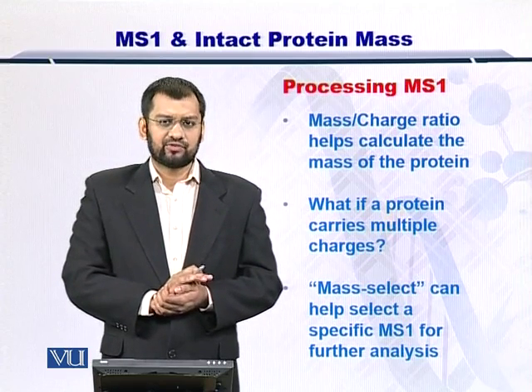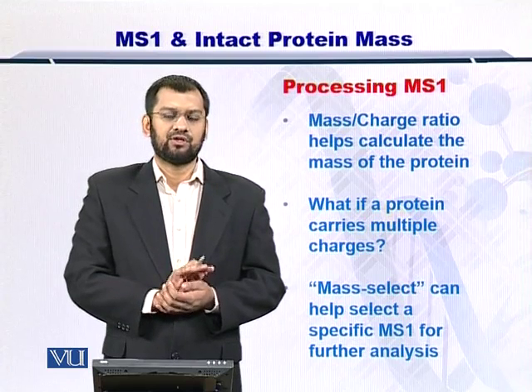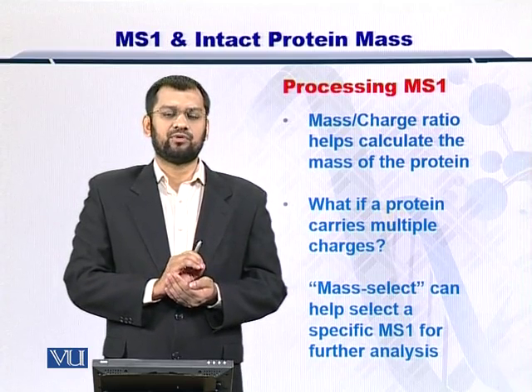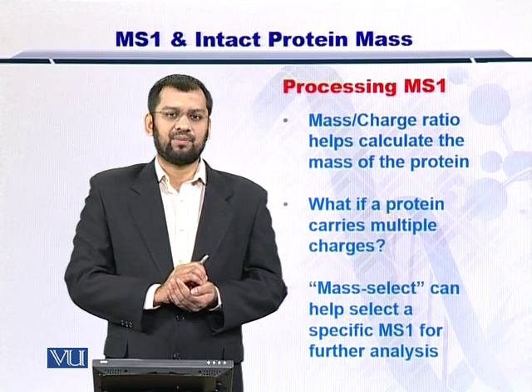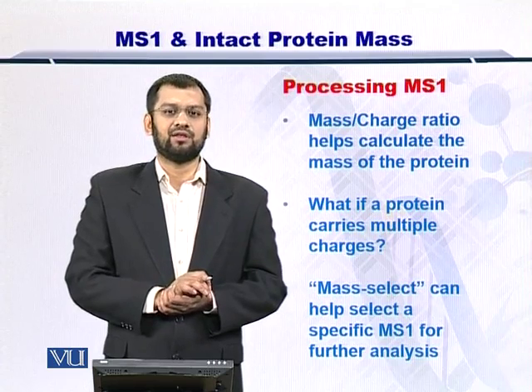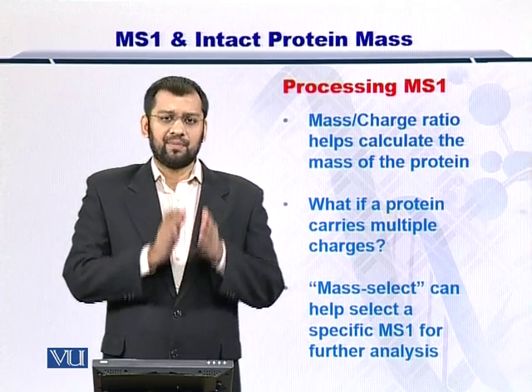The problem that you must cater for is that the charge should be 1 for the same type of intact molecules. If the intact molecule of a type has multiple charge states, then you can have difficulty in arriving at the mass over charge ratio. Also, the mass select.